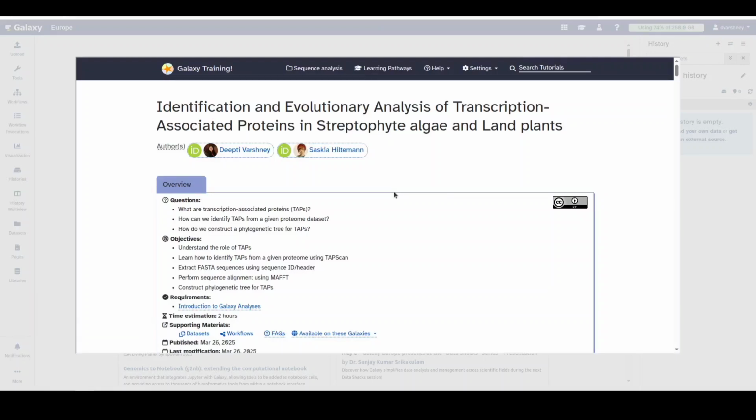And then we select this input sequence. Now we have to fill in the criteria for filtering on header. As we have the list of IDs from the remove beginning tool, we can just click on dataset collection, and your most recent output will appear on this automatically.